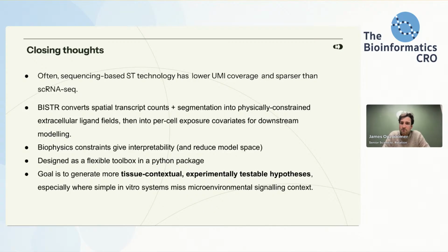We've designed this BISTR method as a flexible toolbox that is deployed as a Python package, which we hope to make publicly available sometime soon. The goal of this approach really is to generate more tissue contextual, experimentally testable hypotheses, especially where simple in vitro systems miss microenvironmental signaling context.